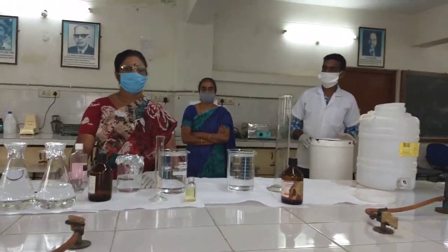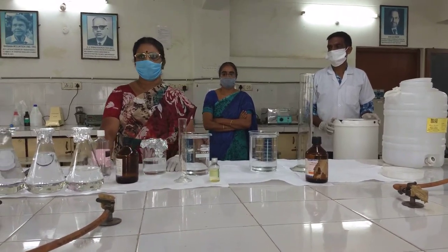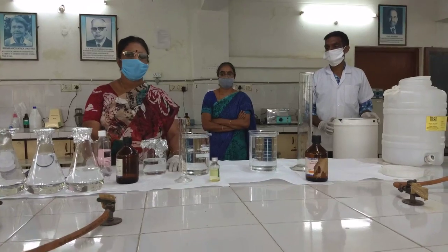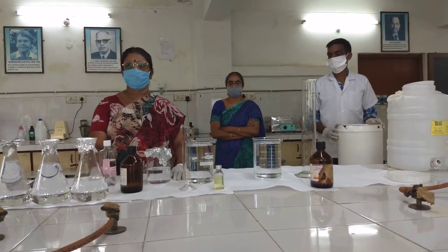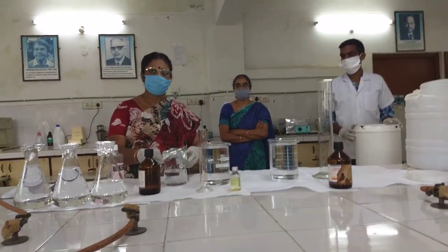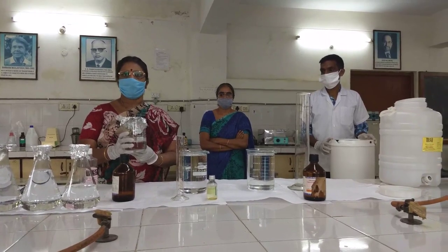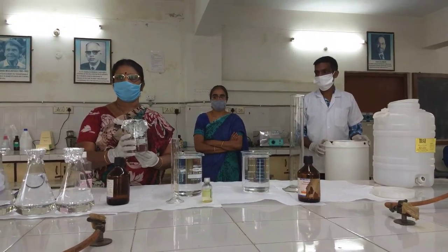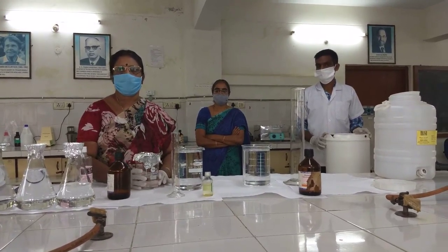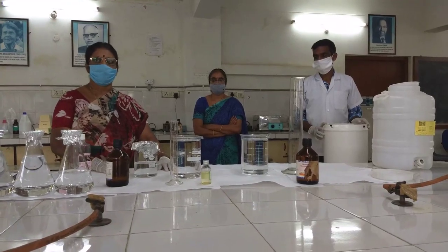The first step is preparation of the hydrogen peroxide. The hydrogen peroxide which is commercially available is 30% and the sanitizer requires 3% hydrogen peroxide. We have already diluted the commercially available hydrogen peroxide to meet the requirements. So the concentration we are using is 3% hydrogen peroxide, which we will be adding to the sanitizer preparation.